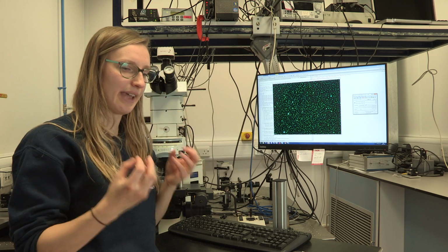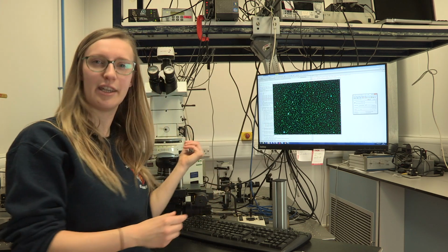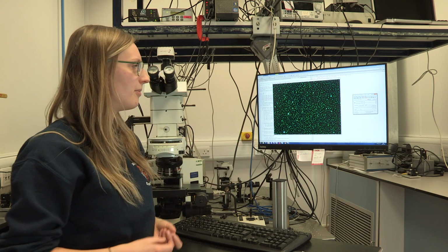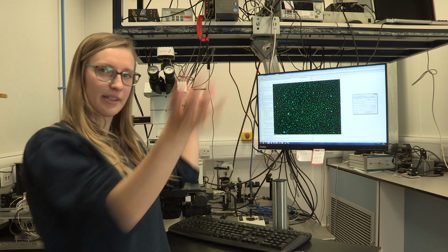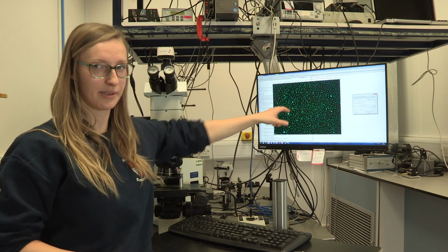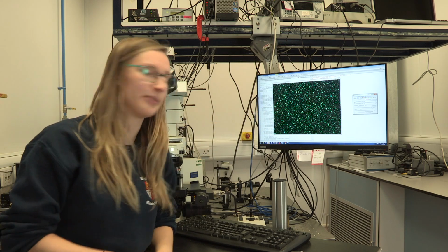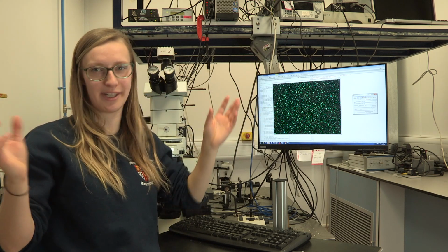So rather than seeing the actual nanoparticle itself, which is way, way, way, way too small to actually see with this rig, what you see instead is all the light which kind of hits it and gets scattered in a random direction. And in that way, we get to see all of the nanoparticles there. Now, what I do with that is that I aim a laser at it, point, shoot, and get all of the signal back out.